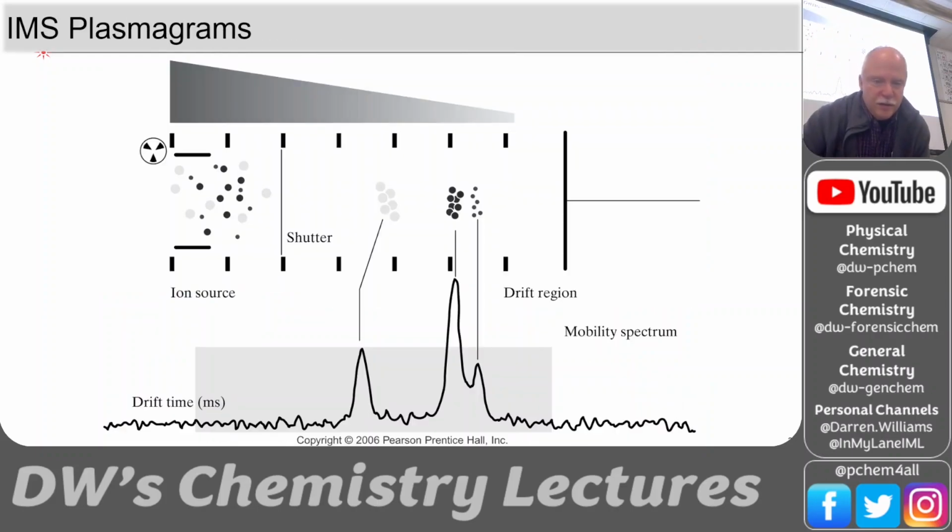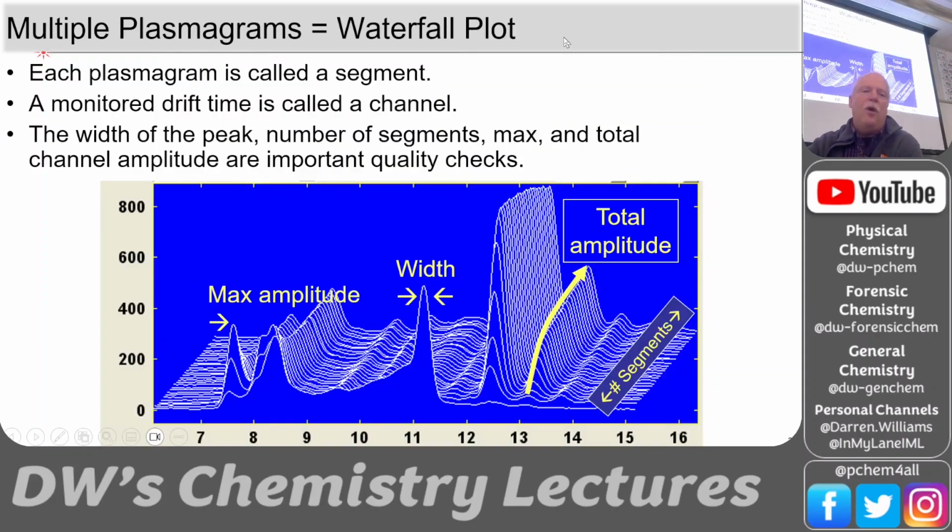This is the type of signal we get. We get what's called a waterfall plot. It has a built-in calibration, and so this very first spectrum here is the calibration gas. They've been using dichloromethane for a long time, but this is the cal.